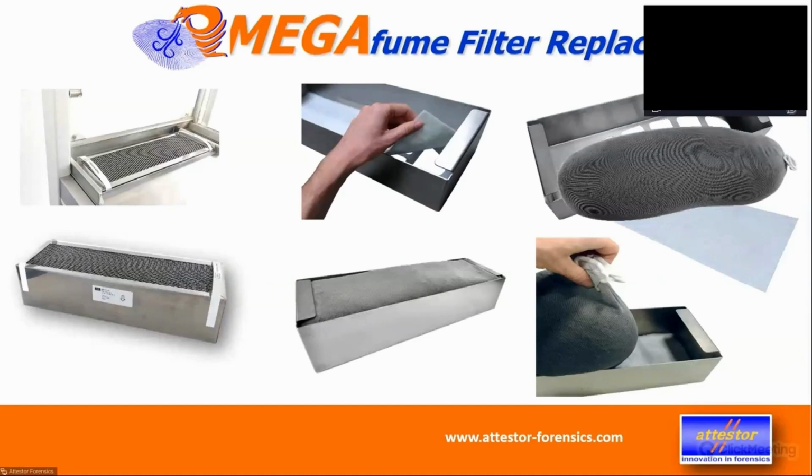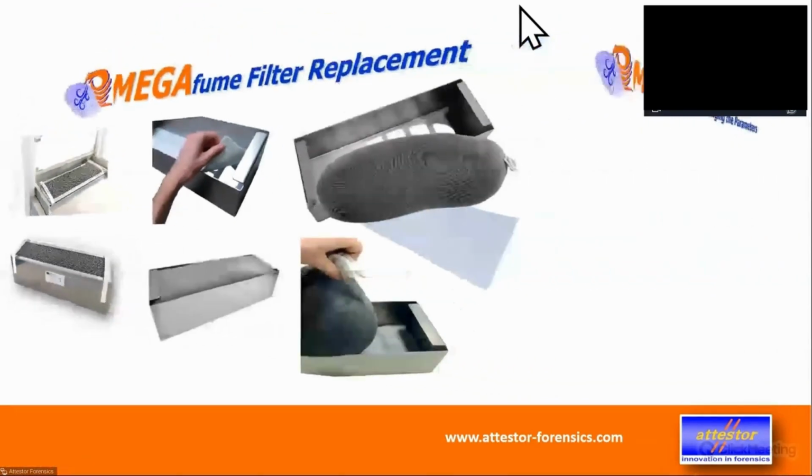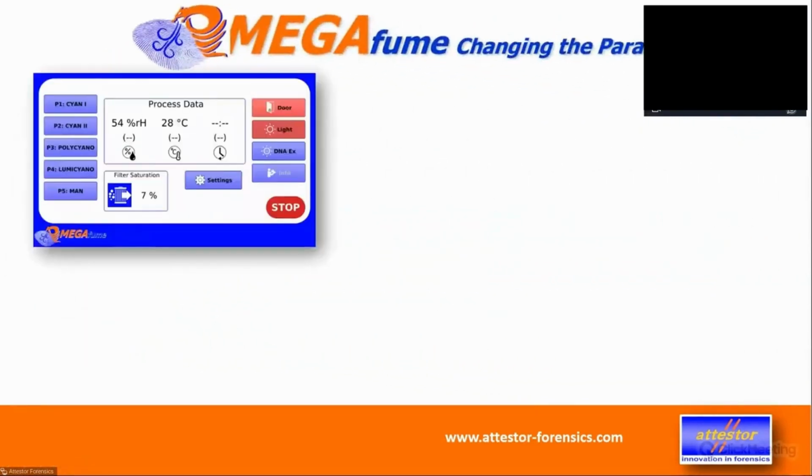That refill solution, how we call it, is actually a bit more expensive until run number 3. And from run number 4 on, you actually save a lot of money because the refill package is approximately between half and 2/3 of the price of a cassette. So it takes a while before you break even price-wise, but then from a certain time on, it really gets more economic and environmentally friendly, if you want.